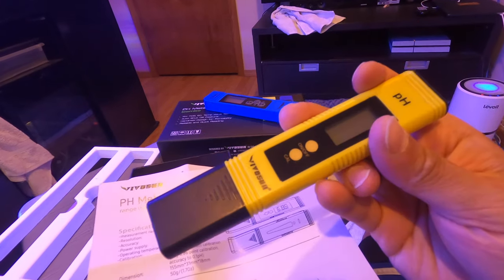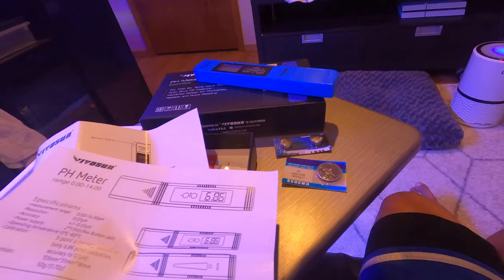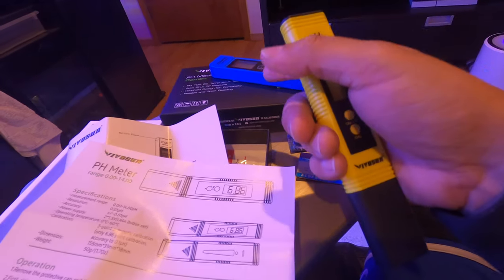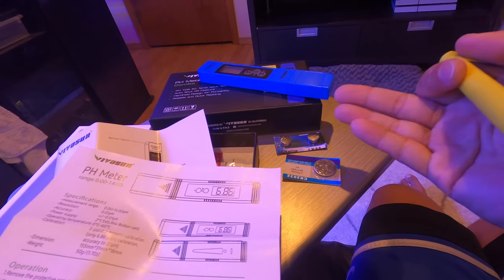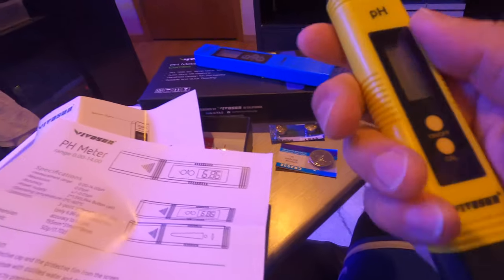Good news — turns out the batteries included here are spare batteries. This $20 pack of two meters comes with spare batteries, and the meters already have batteries installed.